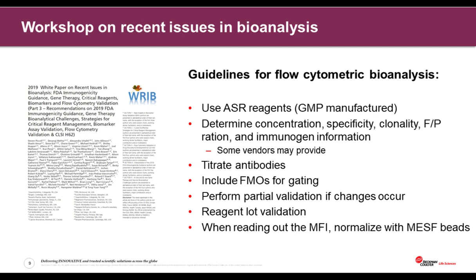Next, it's important to validate and ensure that if you have changed any of the reagents, or if any changes have occurred during the duration of your clinical trial, that you validate this. That also means that if reagent lots have changed, you're going to ensure that these reagent lots are validated and that you've cross-checked them against the previous lot. And lastly, when you're reading an MFI, such as in the case of activation markers, CD69, or whatever it is that you're looking at, ensure that you're normalizing your actual instruments with MESF beads so that you can accurately report out the MFI.